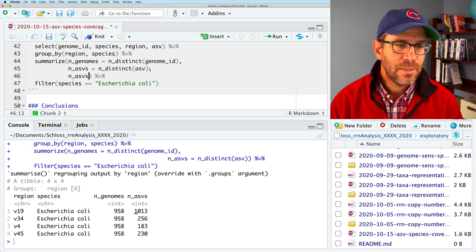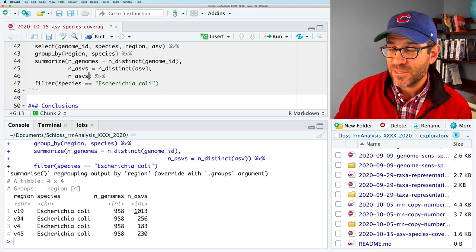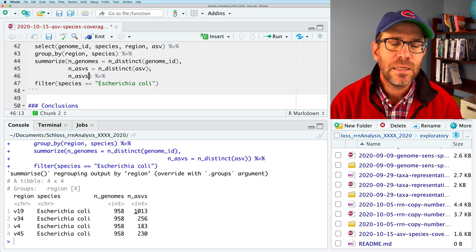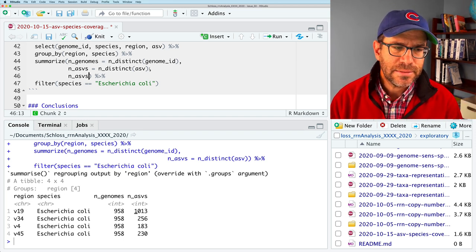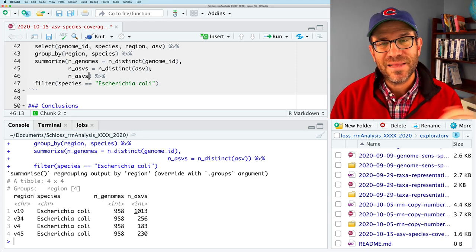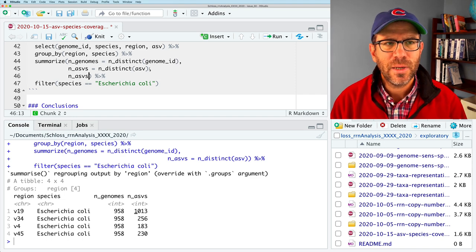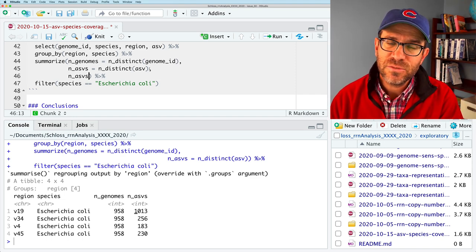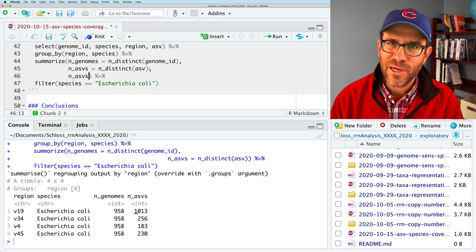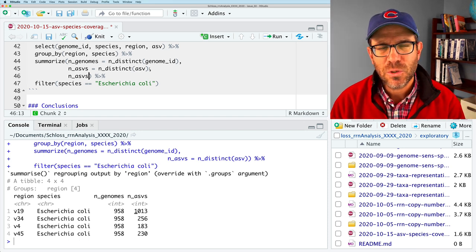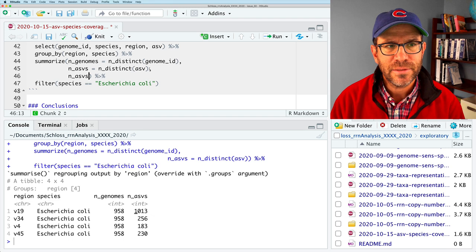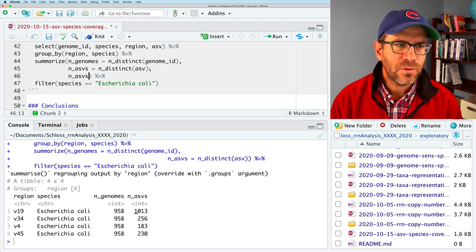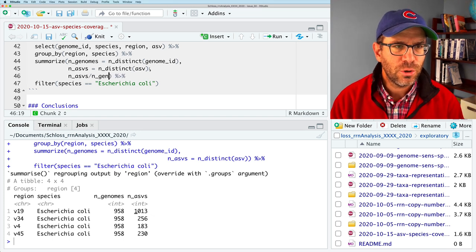And we're going to keep adding to the summarize. We also want the number of ASVs. And that is going to be n distinct ASV. So that's going to be the total number of ASVs that we find across all the genomes in the species. So if we have 958 genomes, we see we have 1,013 total ASVs. So I want to get a ratio. And that's going to be the number of ASVs per genome.